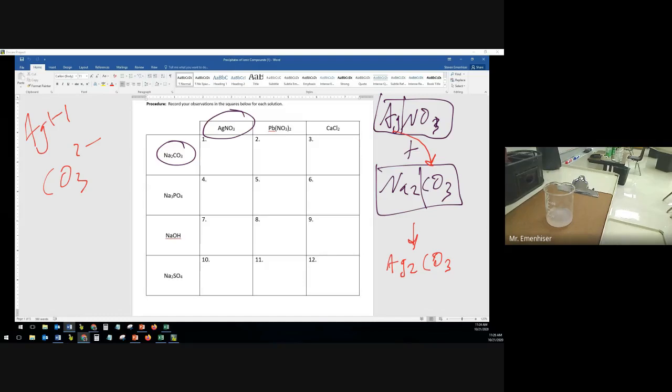And carbonates are insoluble, so this will form a solid. When we mix the two together, we'll see that solid. And then we're going to have sodium go with the nitrate. So these two are going to pair up. Sodium is a +1 charge. It's a group 1 metal. And so that will be NaNO3. Nitrate's a -1, and so we just need 1 of each.